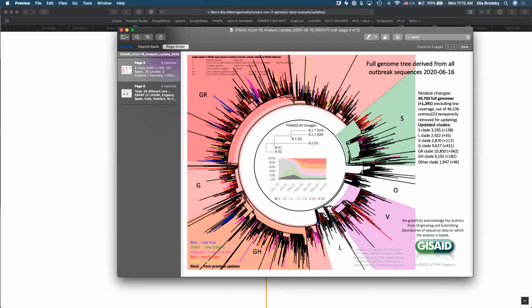Okay, can we get human metagenomic data of affected patients? Yes, we will go through how to find metagenomic data of affected patients. I showed today how to search NCBI for genomic sequences, but you can also look on NCBI for human metagenomic sequences as well. Okay, we will have a session dedicated to that.